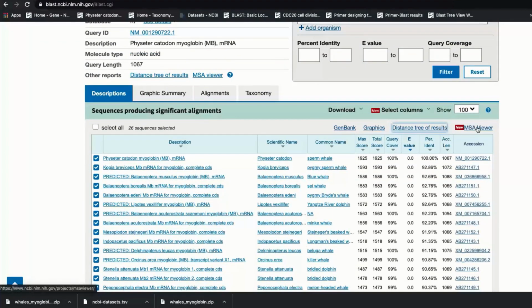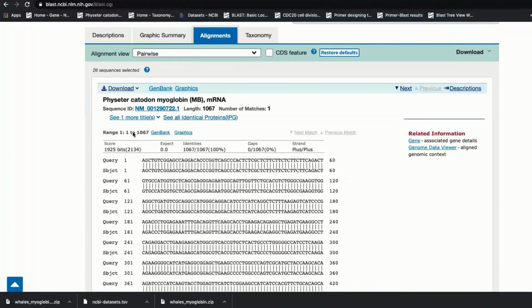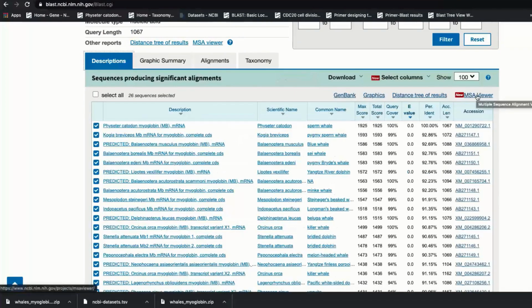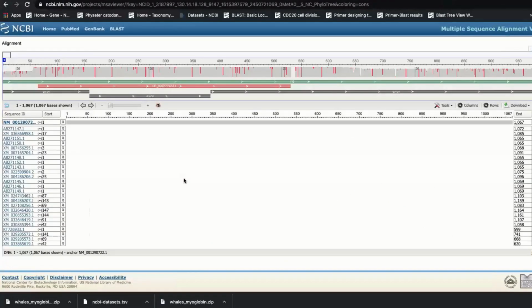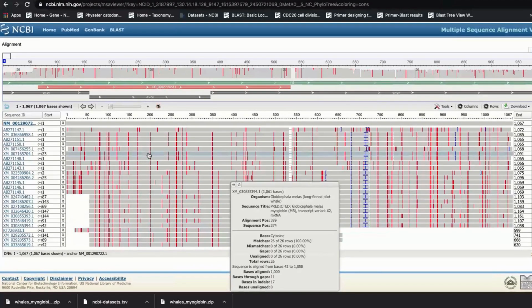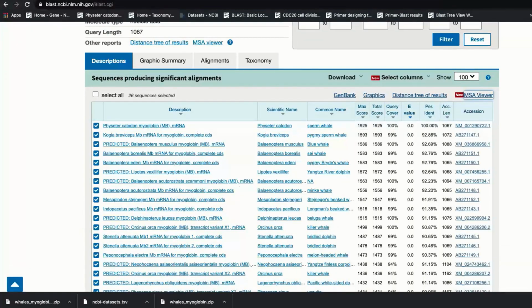And we're not really going to talk about it today, but you can do alignments. Here, these are the alignments against the query sequence. It's something you may be familiar with, more like MUSCLE or ClustalW, but it's a quick and dirty version. We're not going to spend a lot of time here, but I just want to show you that it's an option. It can line up and show you where your sequences are different from each other. Okay, so that was demo number 1.